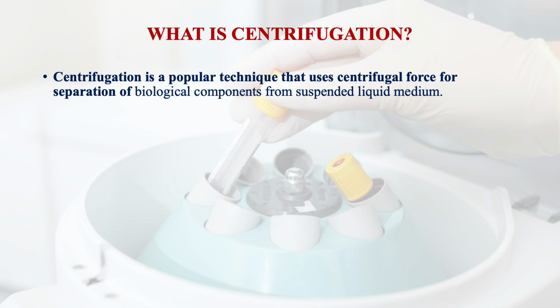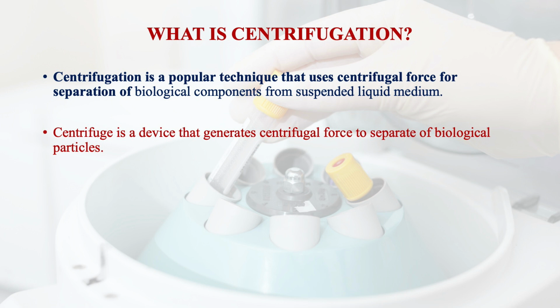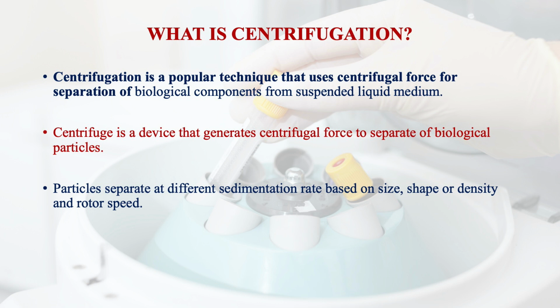Centrifugation is a popular technique that uses centrifugal force for the separation of various biological molecules which are suspended in the liquid medium. Centrifugation separates biological particles based on their size, shape, density and rotor speed. In the centrifugation process we use the centrifuge instrument. This is the basic instrument through which we separate biological molecules based on their size, shape, density and rotor speed. During the centrifugation process we apply the centrifugal force by the centrifuge.